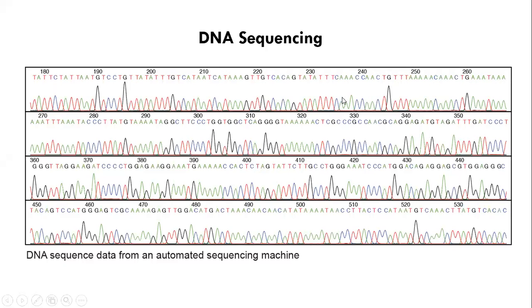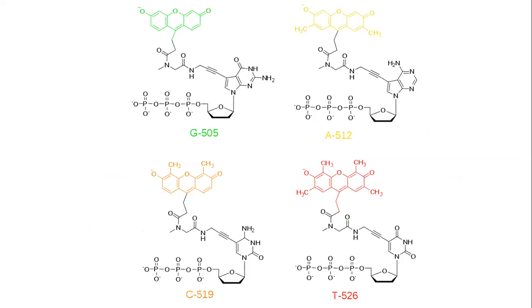Remember that this is complementary coming; the sequence is complementary. This is a template strand. So how can it be done? How was this simplistic way of analyzing DNA sequencing achieved, and what methods did we use? As discussed previously, you can attach a fluorophore. For example, I am talking about a nucleotide here, a sugar and a base, purine or pyrimidine.